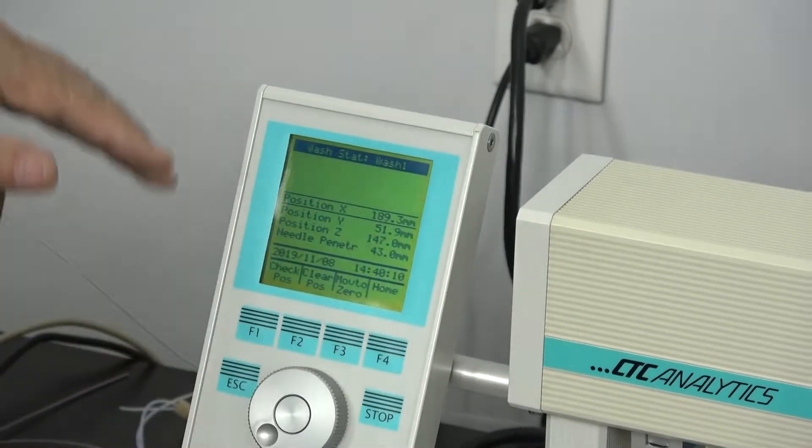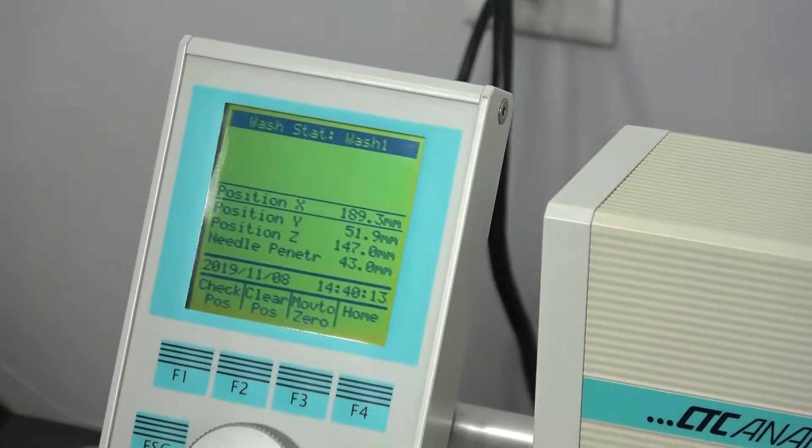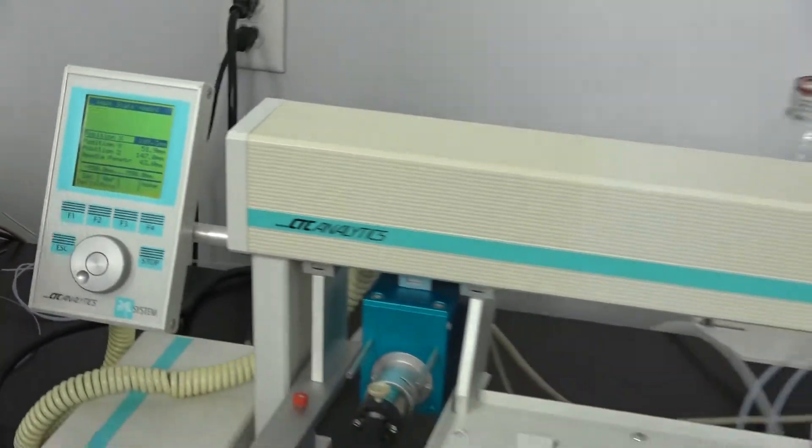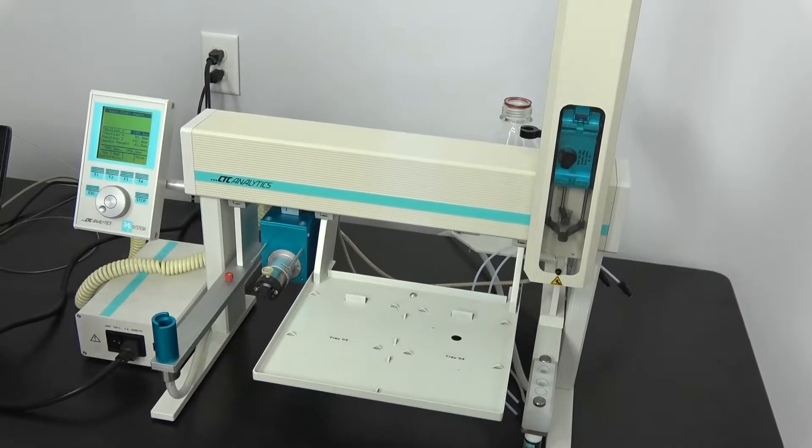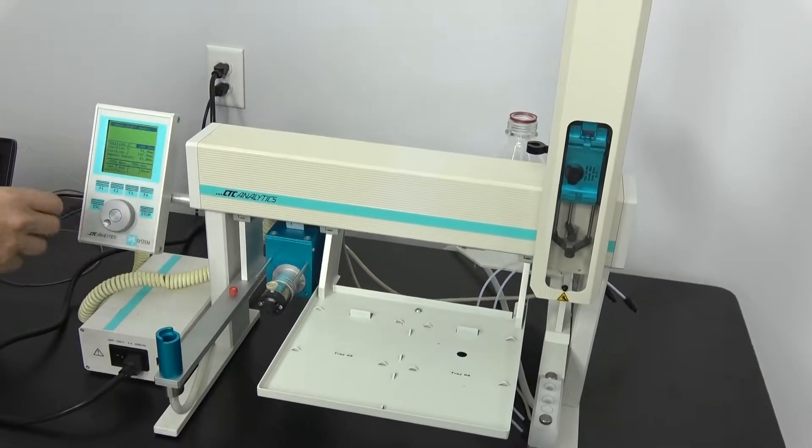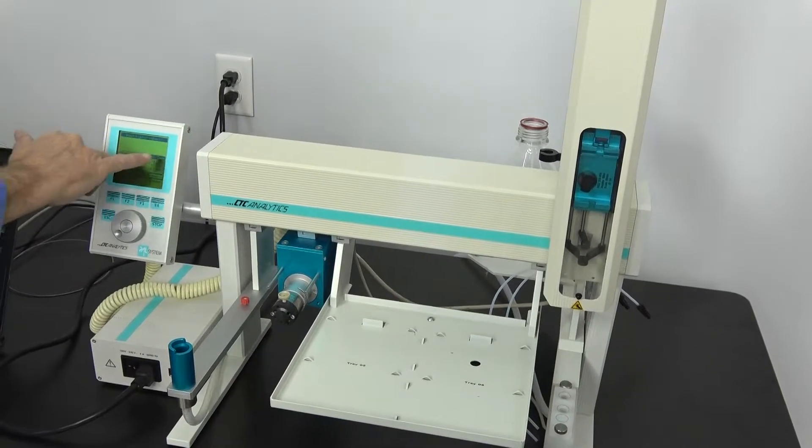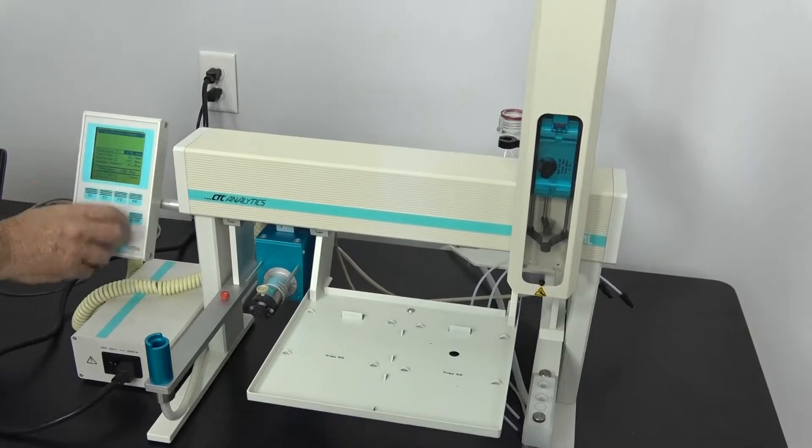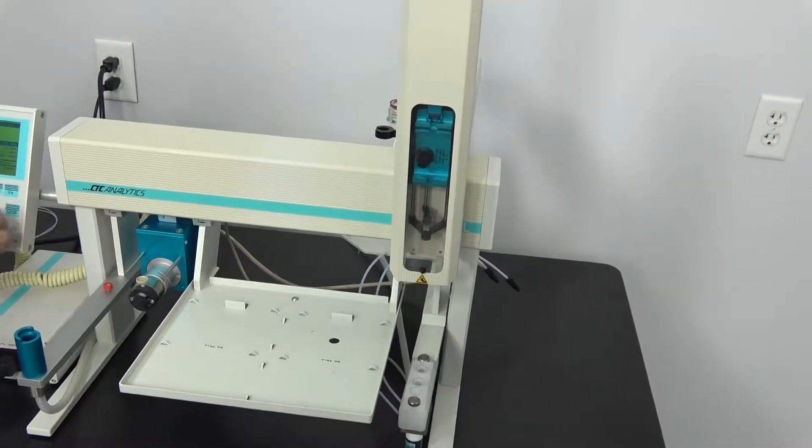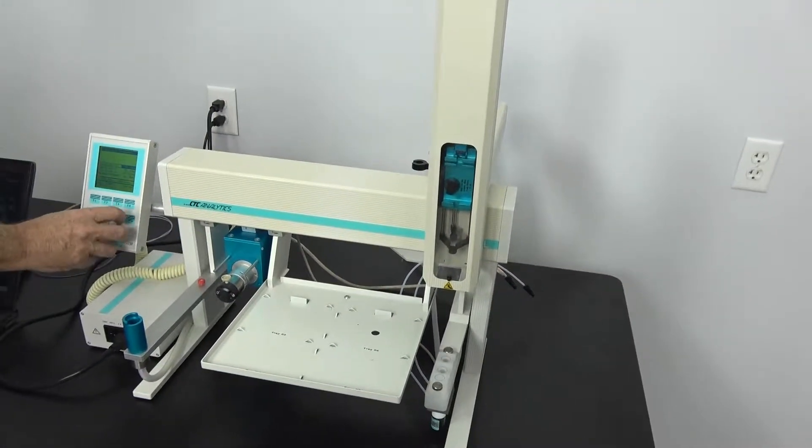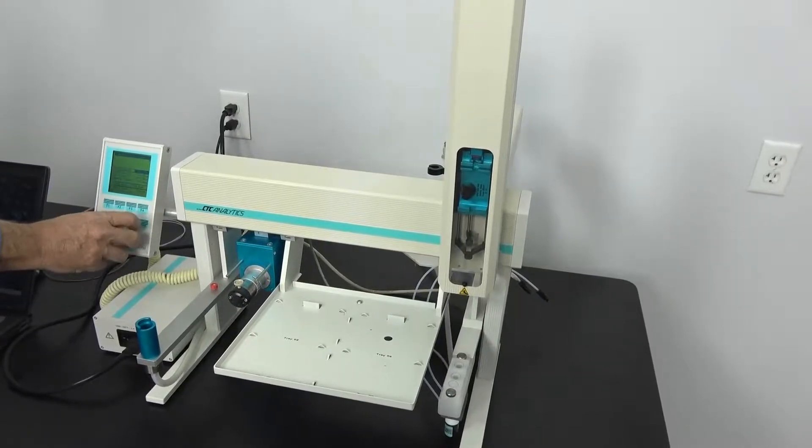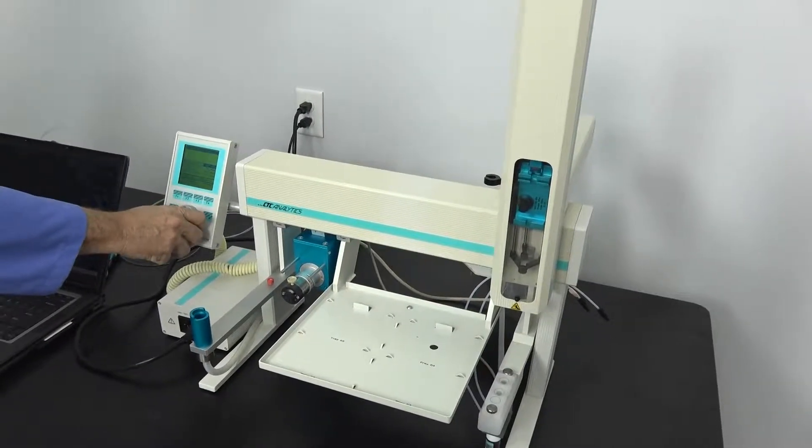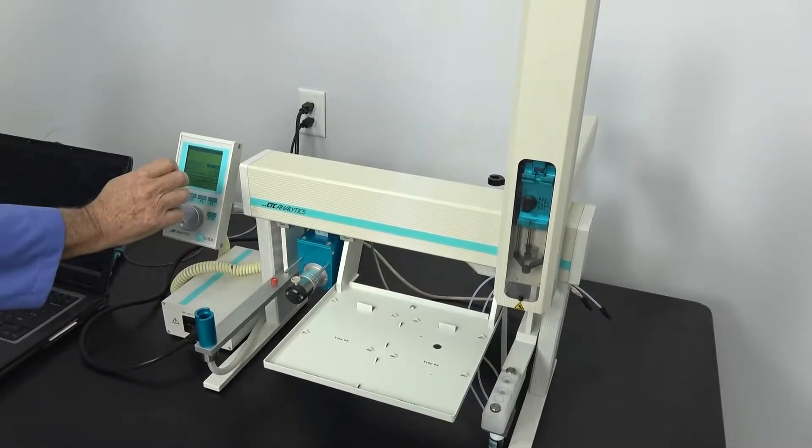And here's where we teach the position. So when we push our center button, that motor is going to take over and go to its position at 189 millimeters. If we're off, if we know that we're off a little bit, we can adjust it. And by turning the knob while that position X line is highlighted, the head will move to that. And it's doing tenths of a millimeter. So it's very, very picky. And it has to be exact.